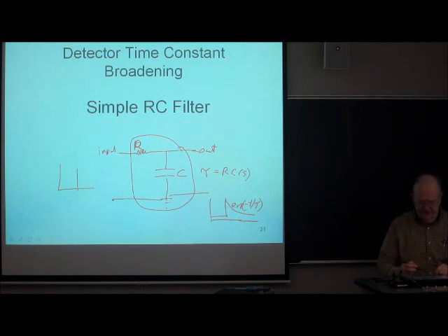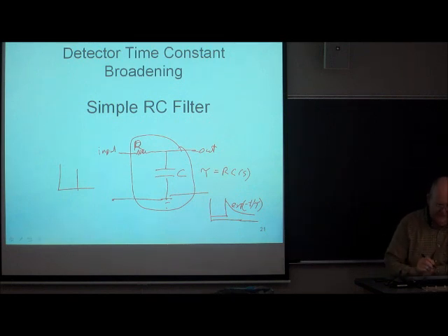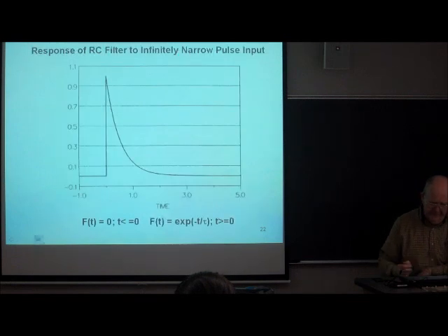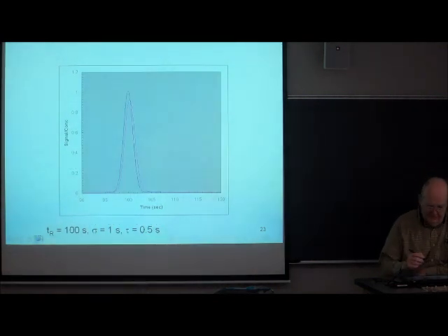If you had electronics and physics, you probably beat this to death in your physics lab. In instrumental analysis, we talk about this sort of thing at some length. So what I'm going to do now is, the signal that comes from my chromatographic signal isn't that. My chromatographic signal is a nice Gaussian signal. I'm going to take a Gaussian signal and put it into this low-pass filter. So there's my low-pass filter response. I'm going to put a Gaussian into it now. And this is what I'm going to see.